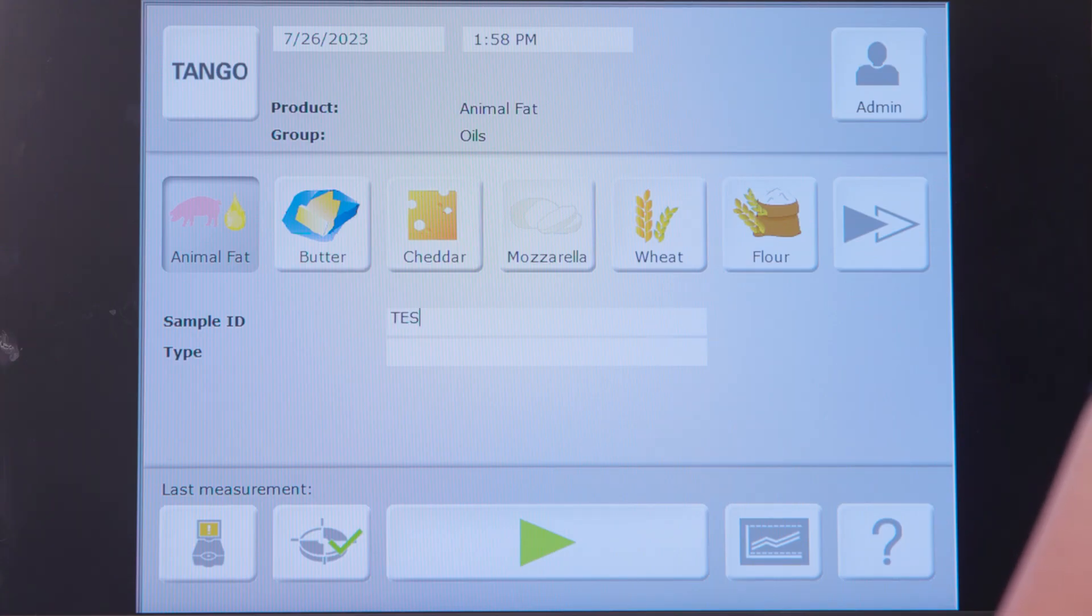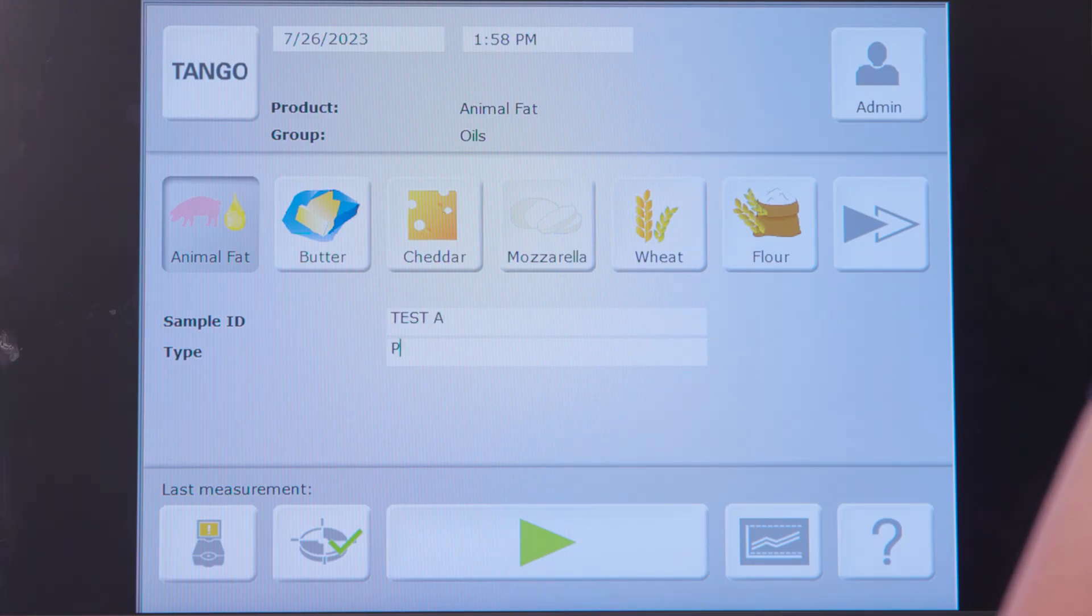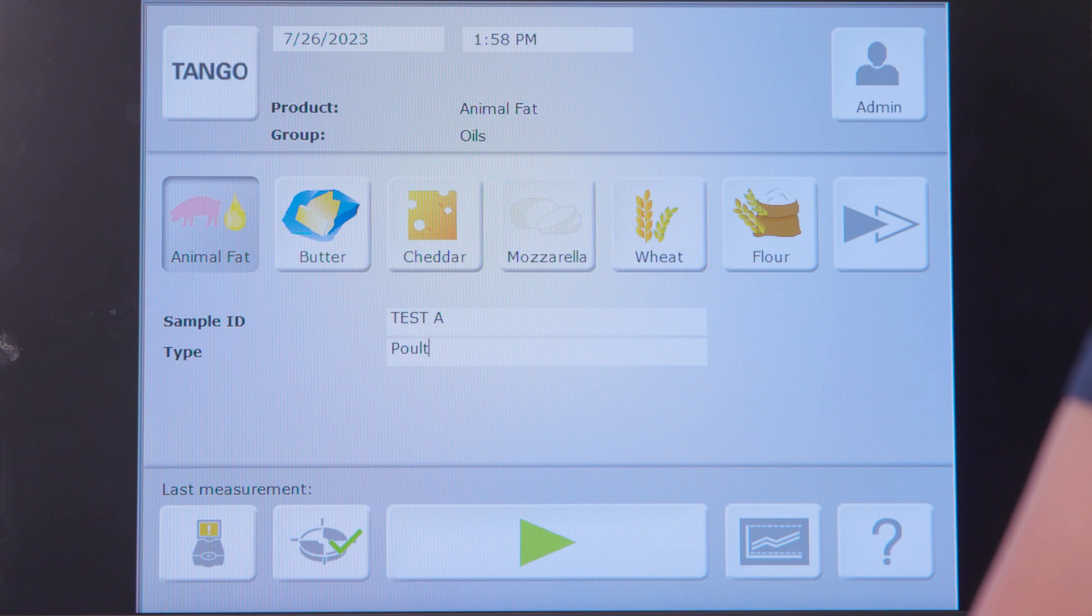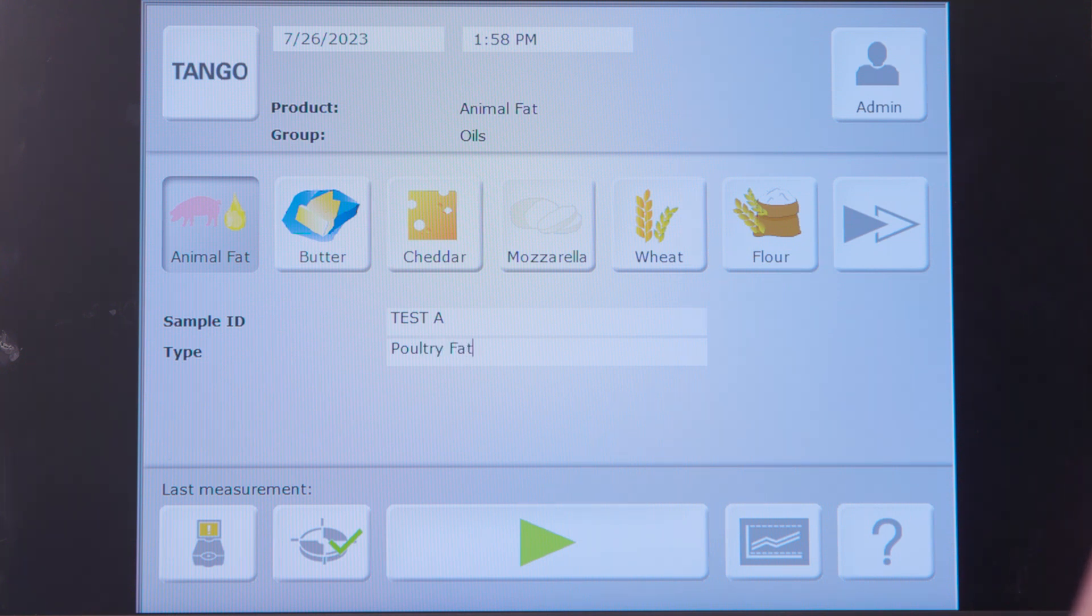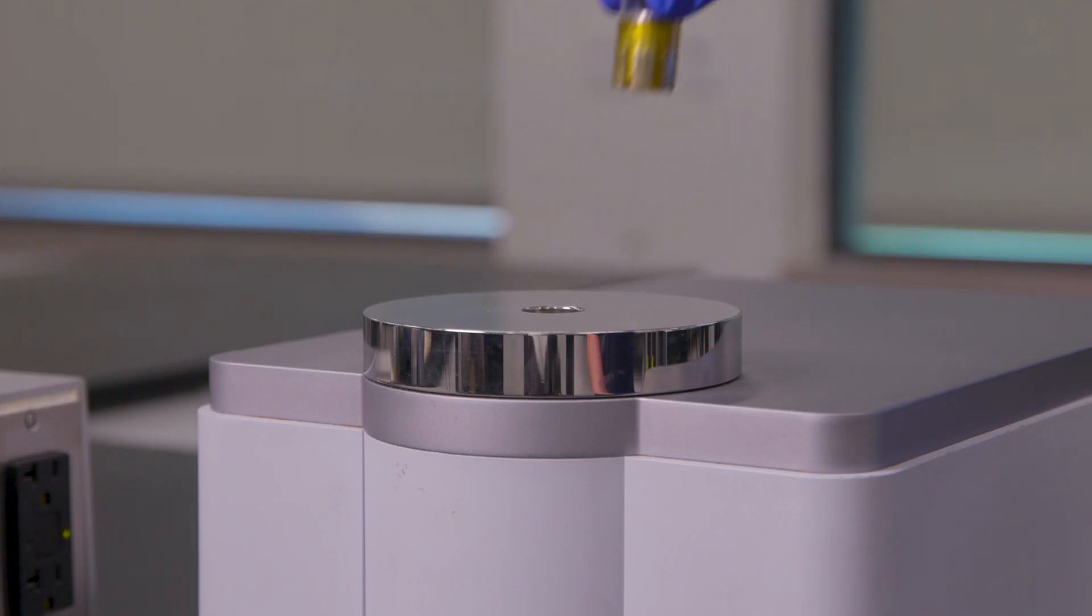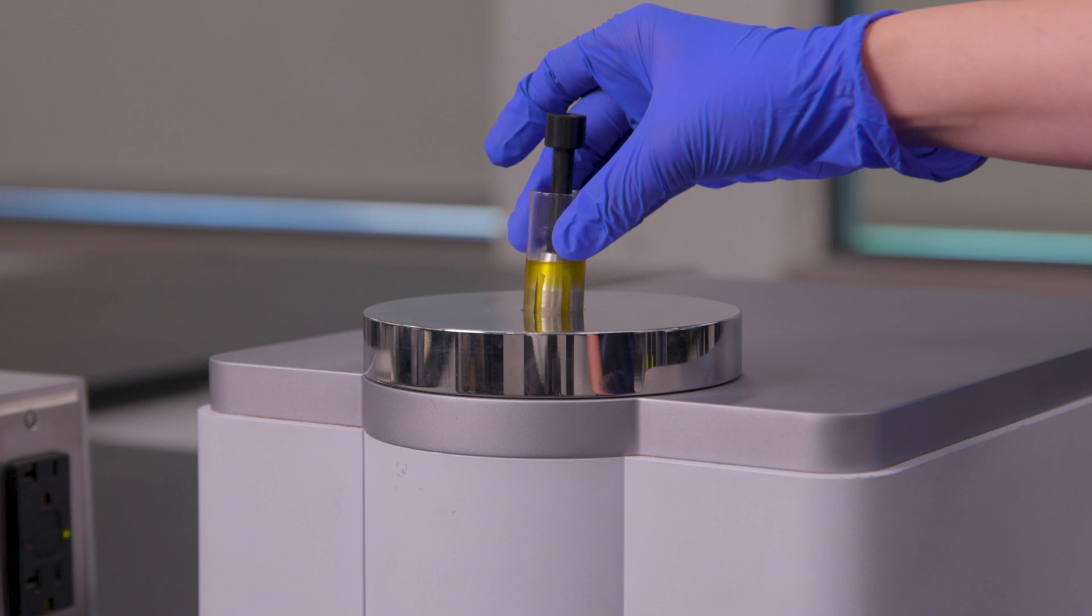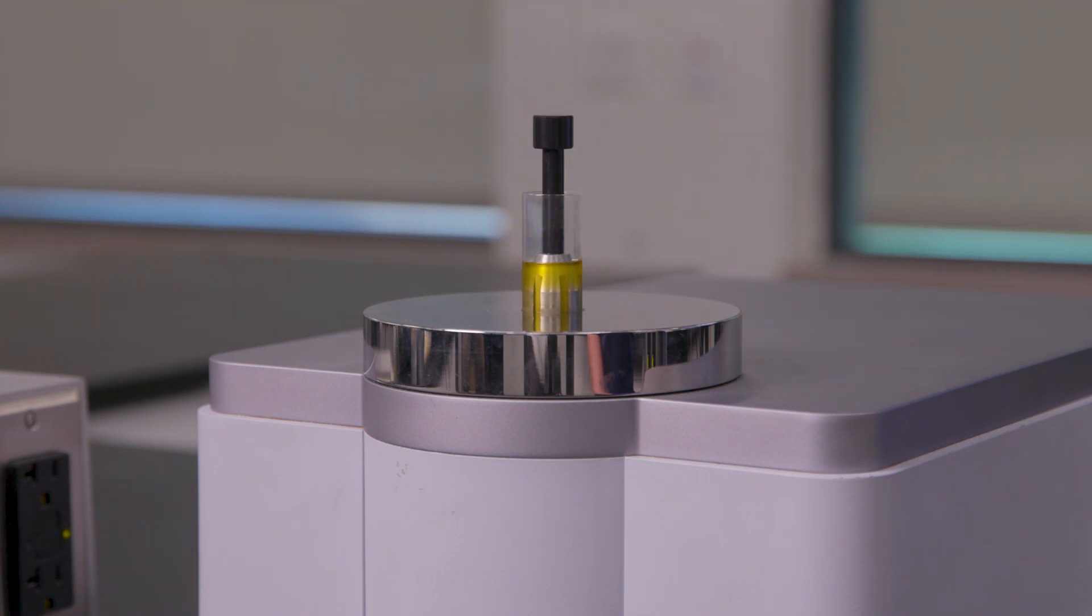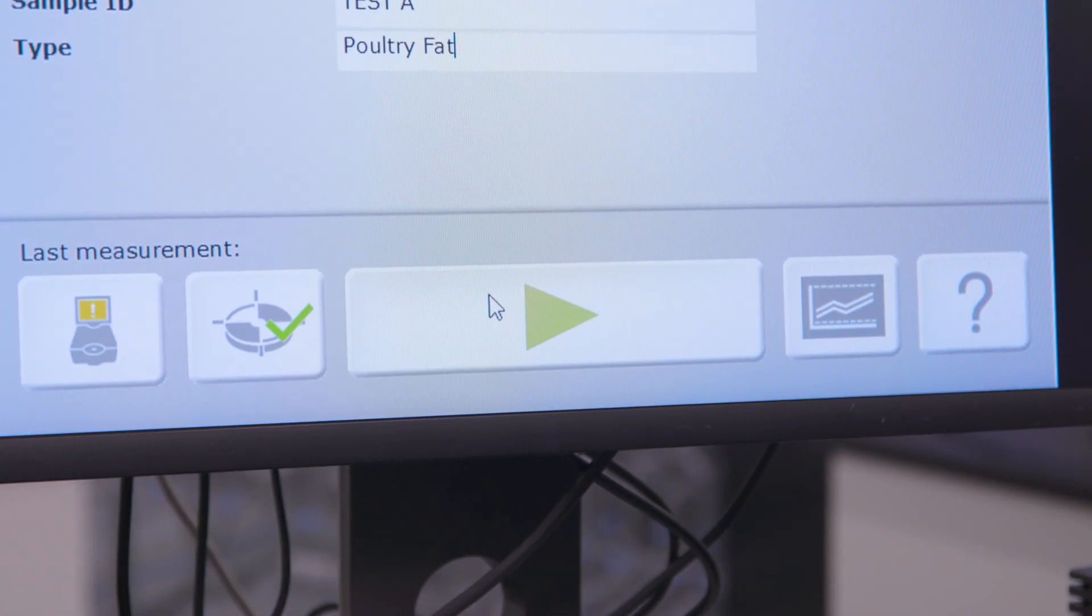Once our sample is appropriately heated, we'll select our product in the Tango GUI and put any identifying information that is unique to that sample and place our vial with the transmission stamp on the sample window and simply hit go.